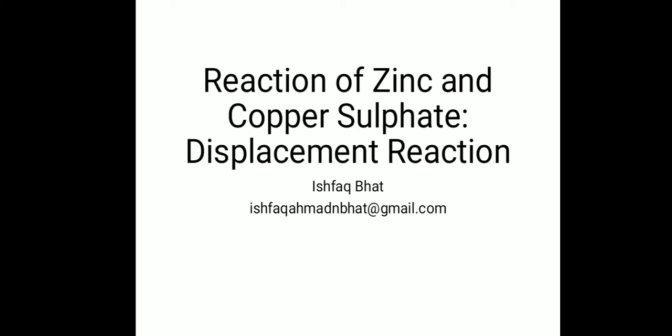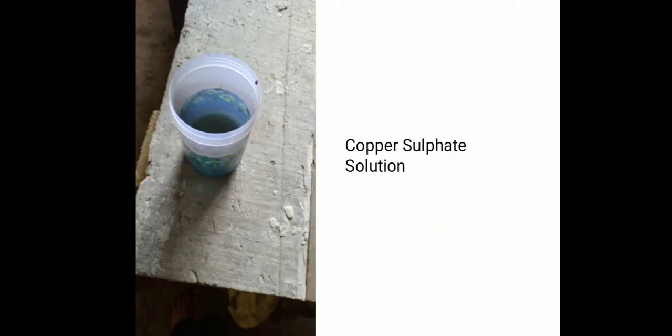It's a displacement reaction. So the materials required are zinc and copper sulfate solution. This is a copper sulfate solution that we have prepared in a previous video. You can link to that: how to prepare copper sulfate solution from sulfuric acid by electrolysis.